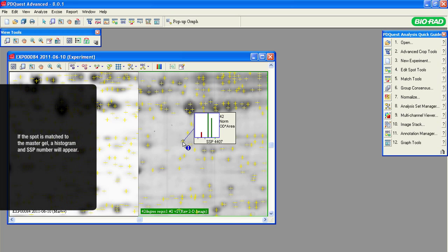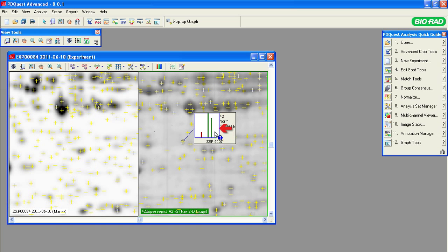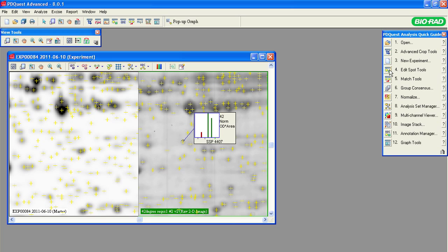Notice that if the spot-like artifact were matched to a spot on the master gel, the pop-up graph will show its SSP number and the histogram. To remove the artifact on the gel image, click the Edit Spot Tools on the Quick Guide to open this collection of spot editing tools. First, let's use the Remove Spot tool. It can be used to remove spots that are associated with a defect on a single gel, such as a bubble or a tear.